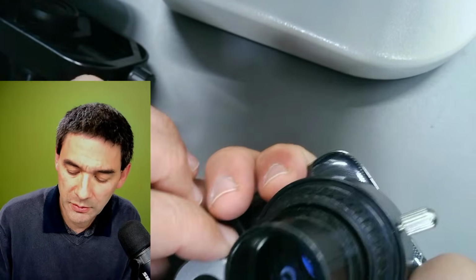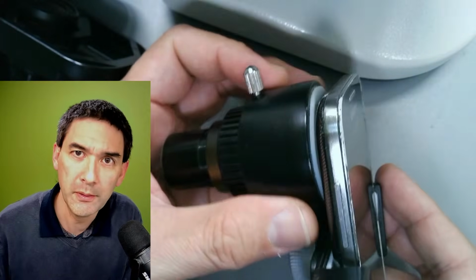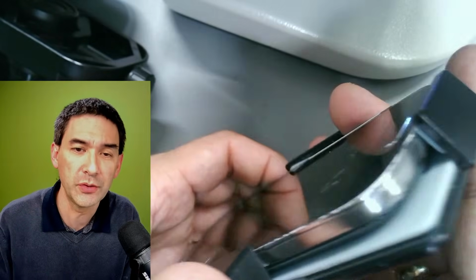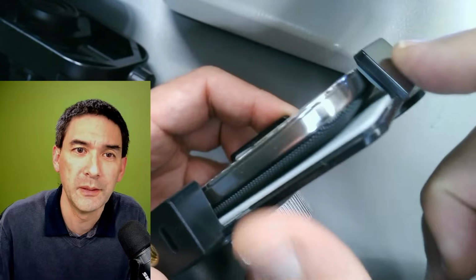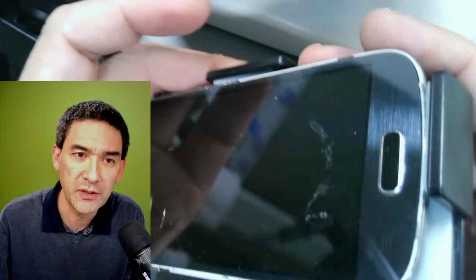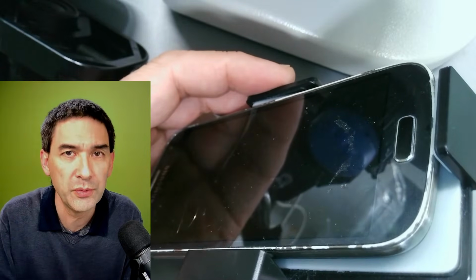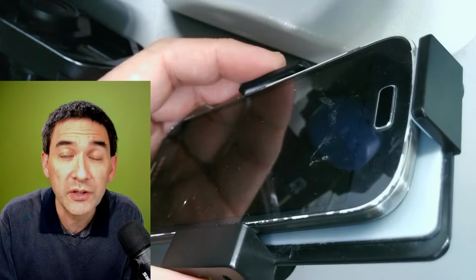And then you can already see the first problem. Not a big problem, but in my case it would be a problem for live streaming, because look, if you turn it around here, you see the connector for the USB is covered up by this thing over here. This is the reason why I'm not using this here, because I've got a pretty old mobile phone now being used as a camera, and therefore I need to always have it connected to the USB.